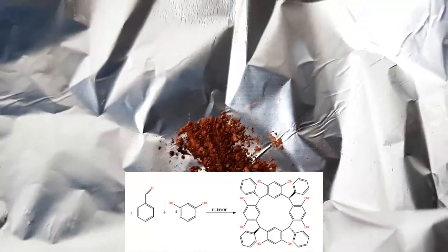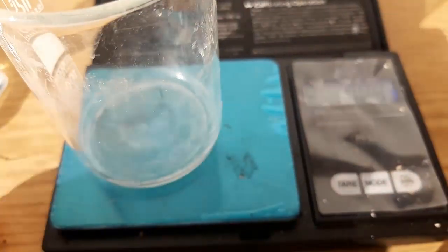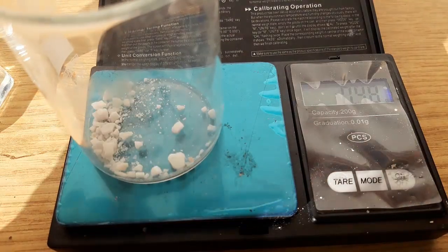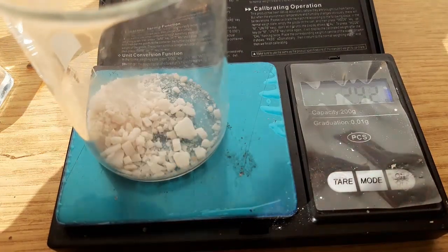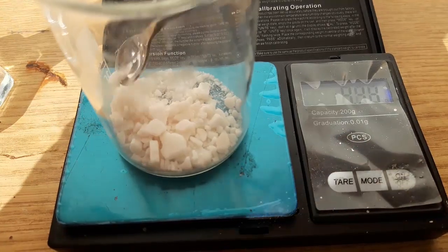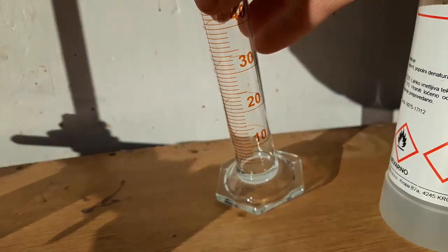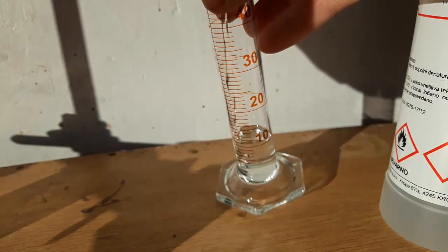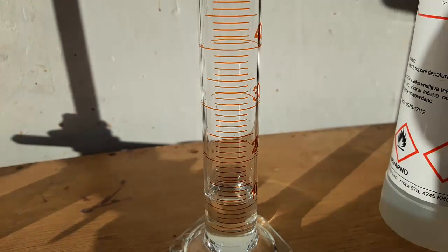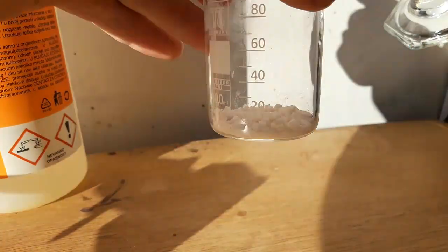We'll be making it by the condensation of resorcinol with benzaldehyde. First, weigh out 5.6 grams of resorcinol. Then we prepare a solution of concentrated hydrochloric acid and ethanol in a 4 to 1 ratio. We need 50 milliliters of solvent, so that means 10 milliliters of hydrochloric acid and 40 milliliters of ethanol.